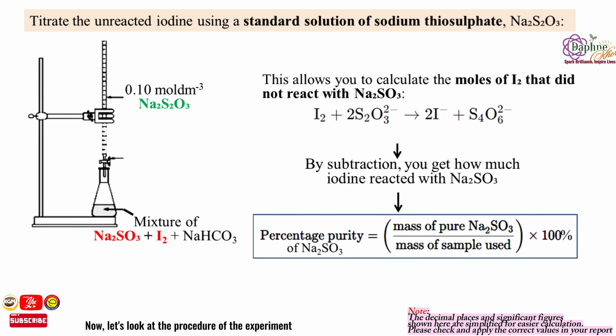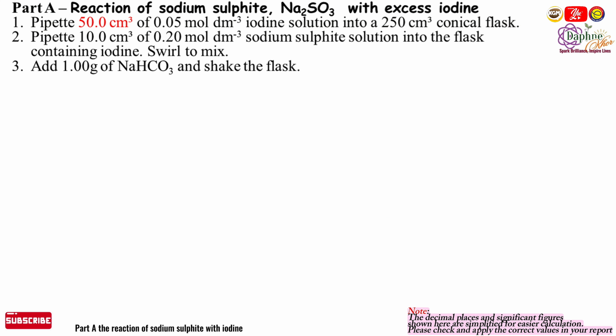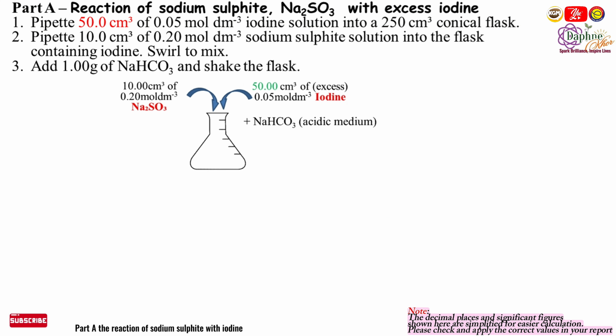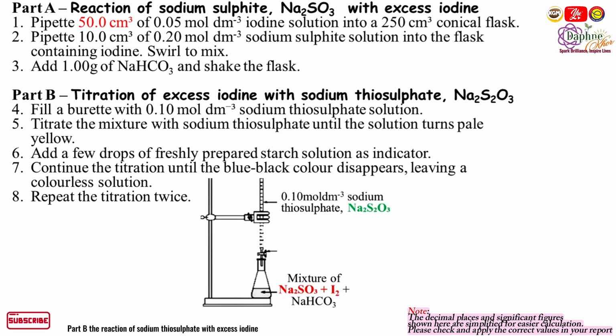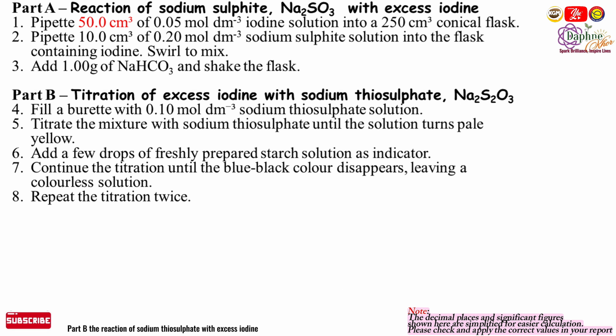Now, let's look at the procedure of the experiment. Part A, the reaction of sodium sulphite with iodine. Part B, the reaction of sodium thiosulphate with excess iodine.